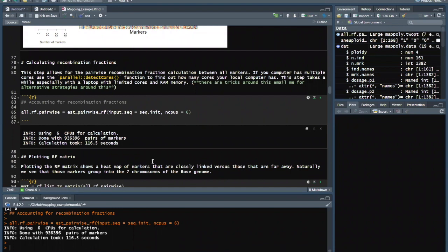You can choose to just use grouping, which is the next step, and just use the grouping algorithms. And you might be able to get it to group, you might not, just depending on how clean your data is. No, I meant like if only include the SNP positions if those are present in the parents.